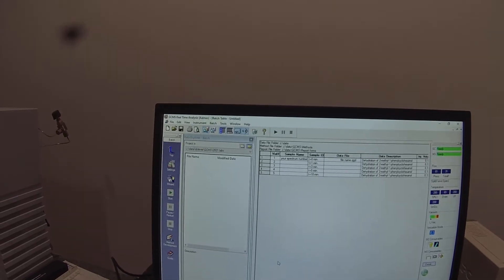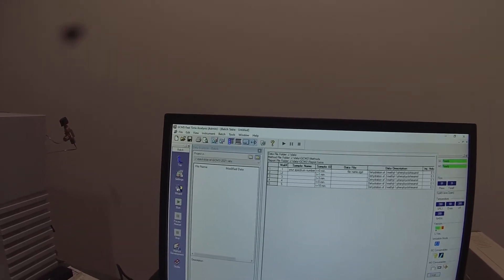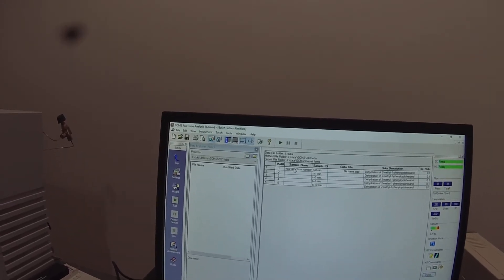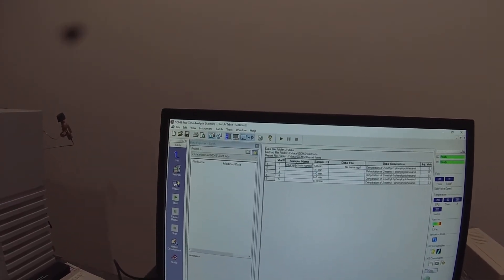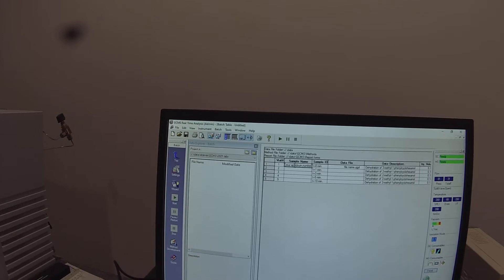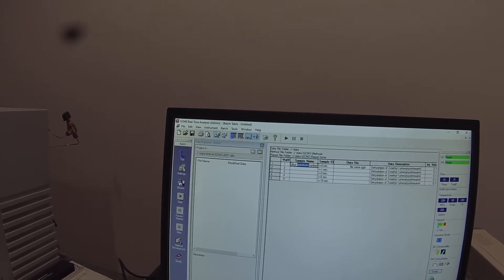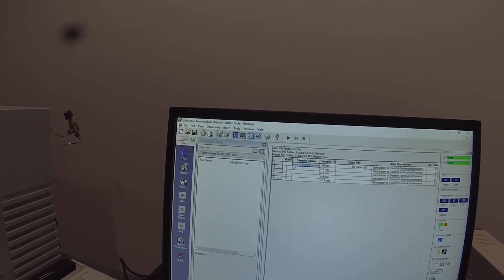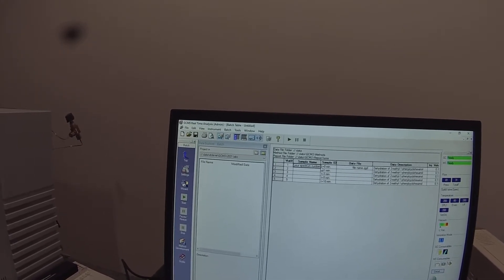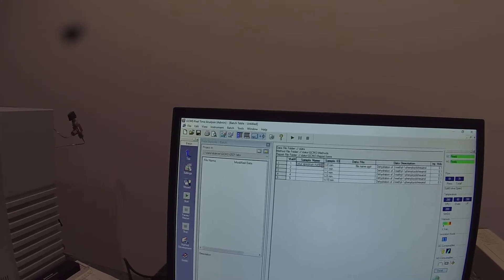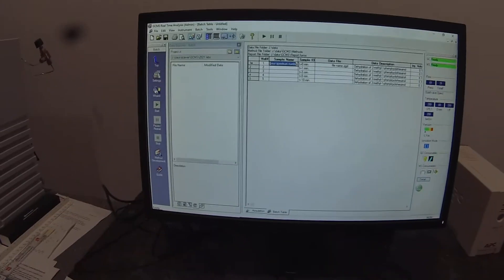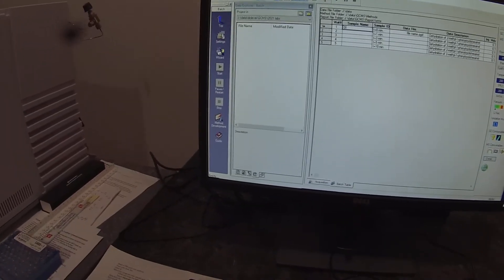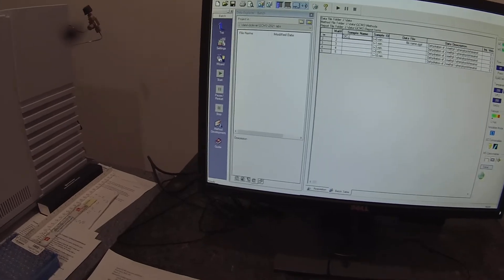So I delete everything below the first four. And so then under vial number, I'm in one, two, three, and four. So I want to highlight all of that and put in my lot number.